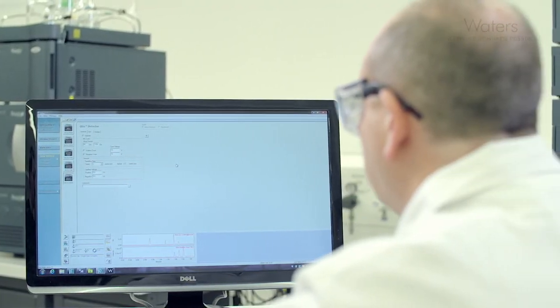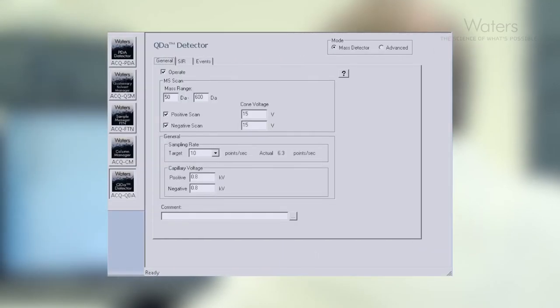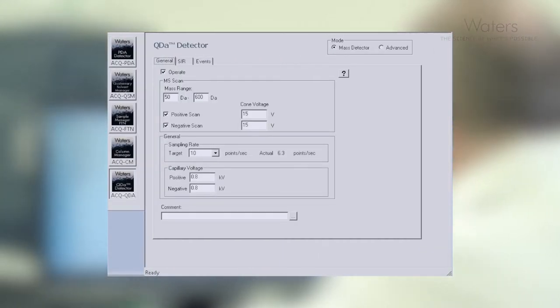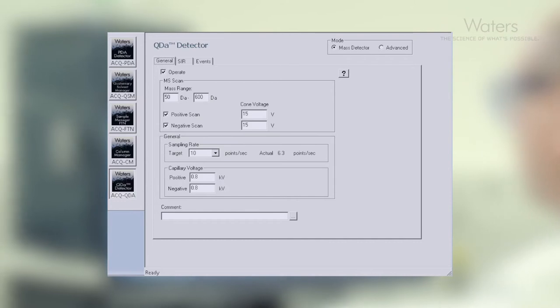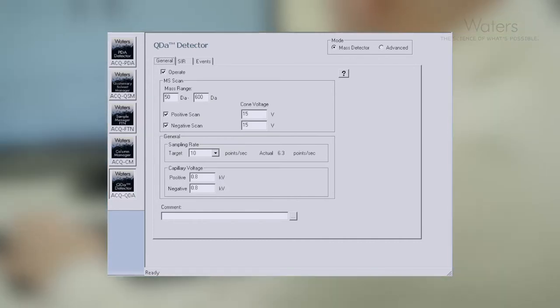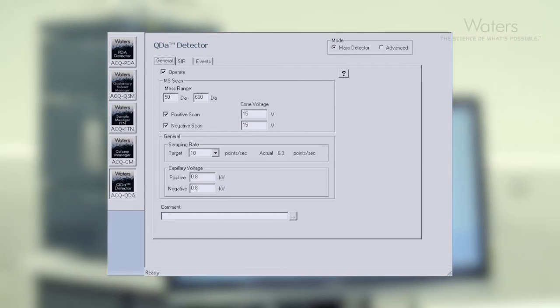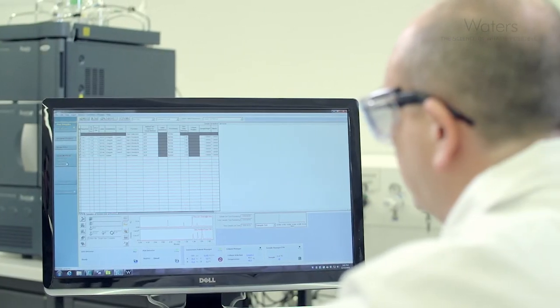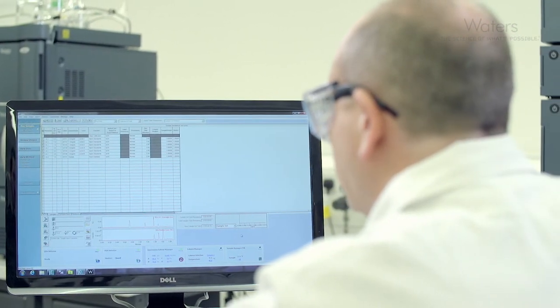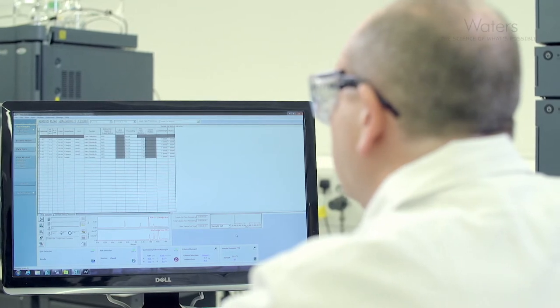For those of you that are familiar with Empower, you will notice that the setup parameters to acquire data are extremely similar to those which you would use if you're acquiring data from a photodiode array. The main difference is that you are using a mass range rather than a UV range. Once we have entered these parameters, we are ready to make our first injection. It really is as straightforward as that.